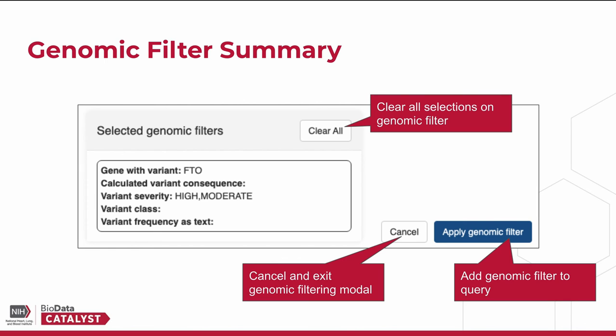We can start a fresh genomic filter by clicking the Clear All button, cancel the filter and exit the genomic filtering modal by clicking the Cancel button, or add the filter to our query by clicking the Apply Genomic Filter button.